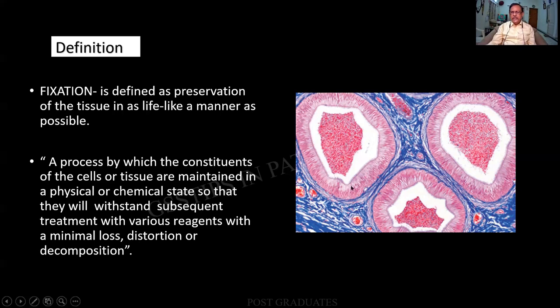And incidentally, this is one of the trichrome slides that we are seeing, beautifully stained, no overstaining or understaining. Look at the clarity it has brought about. I would request you students to kindly learn the definitions by heart.